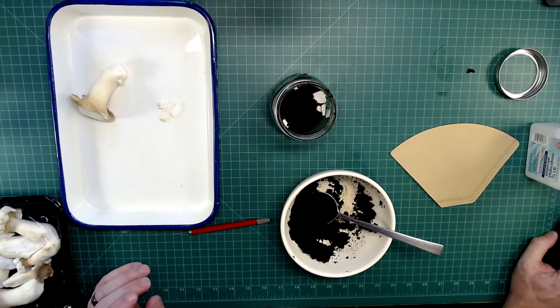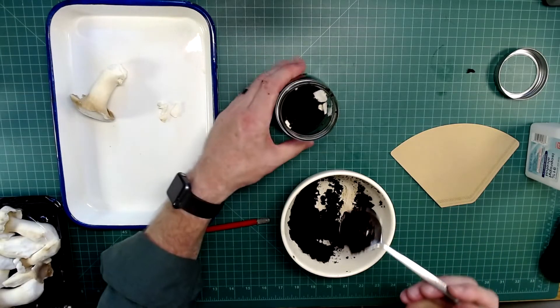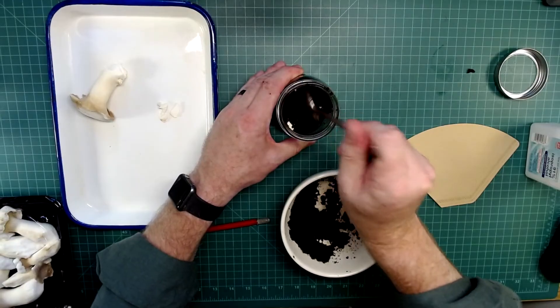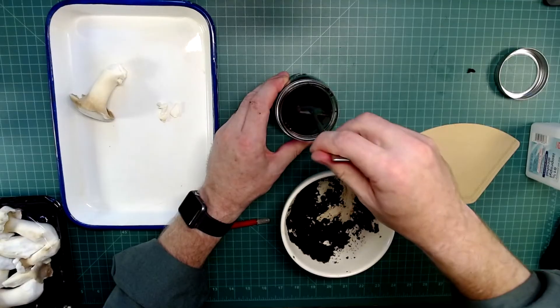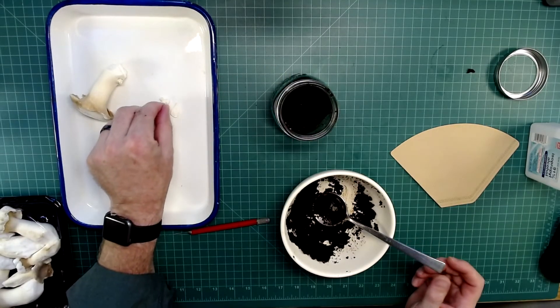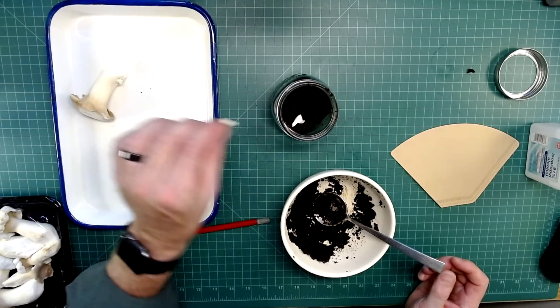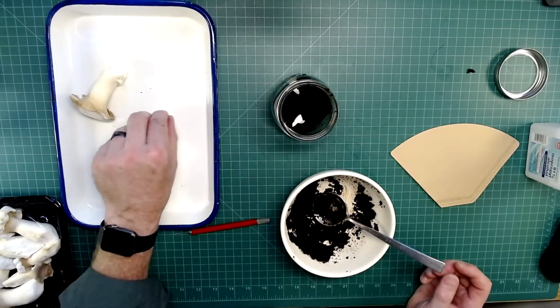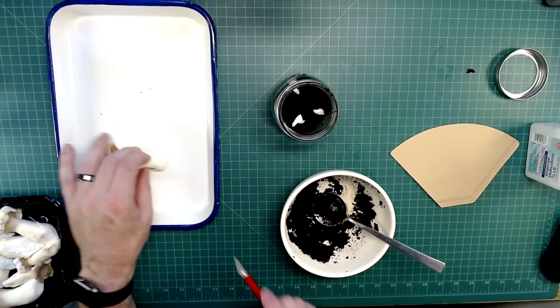In addition to coffee grounds, I've also used loose tea in the past, which works quite well. I've also used craft paper, which I've basically boiled for about a half an hour — that's really just to kill anything embedded within it, since it's usually garbage paper like from a grocery bag.